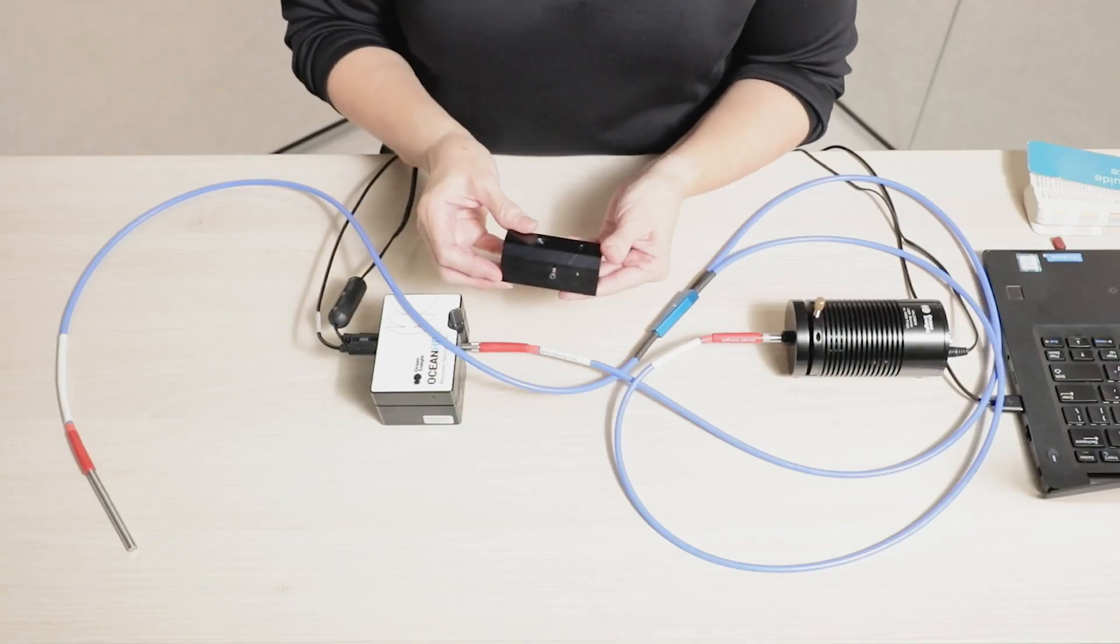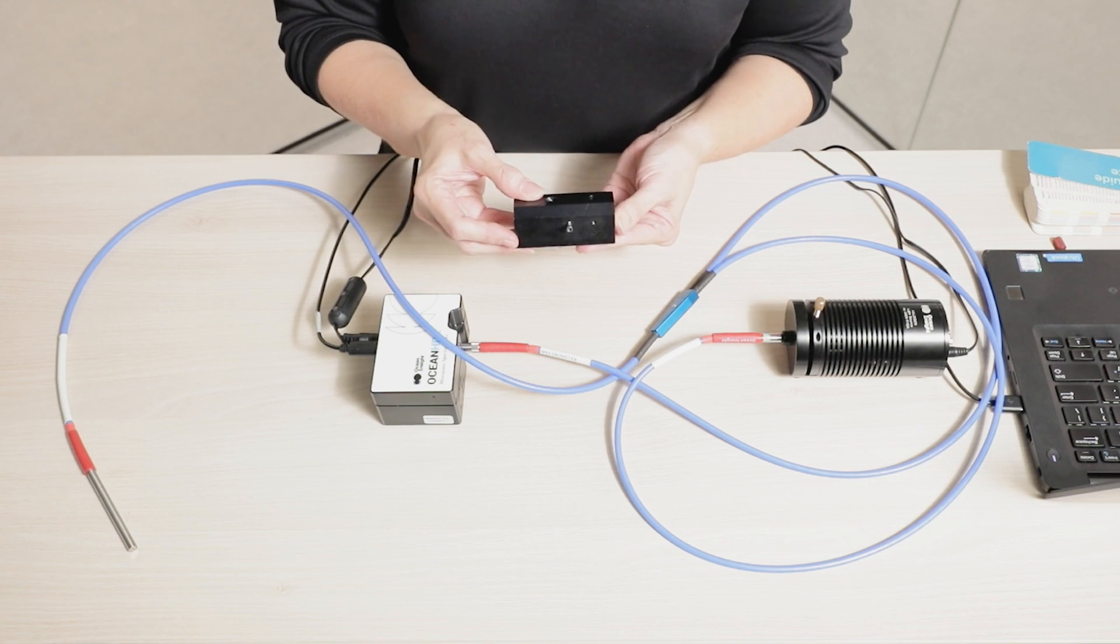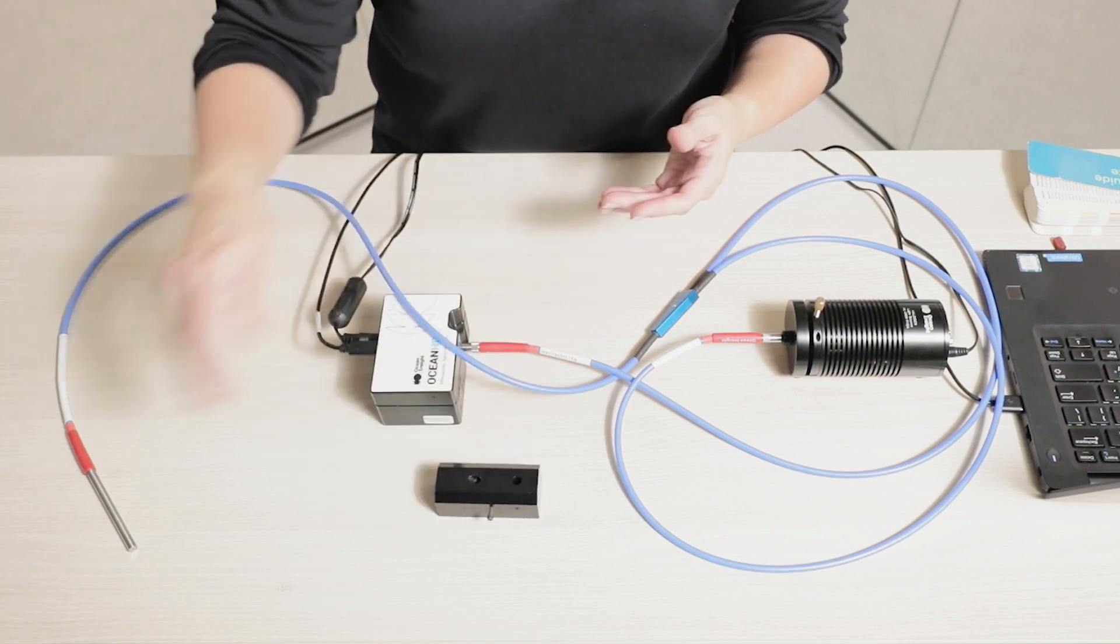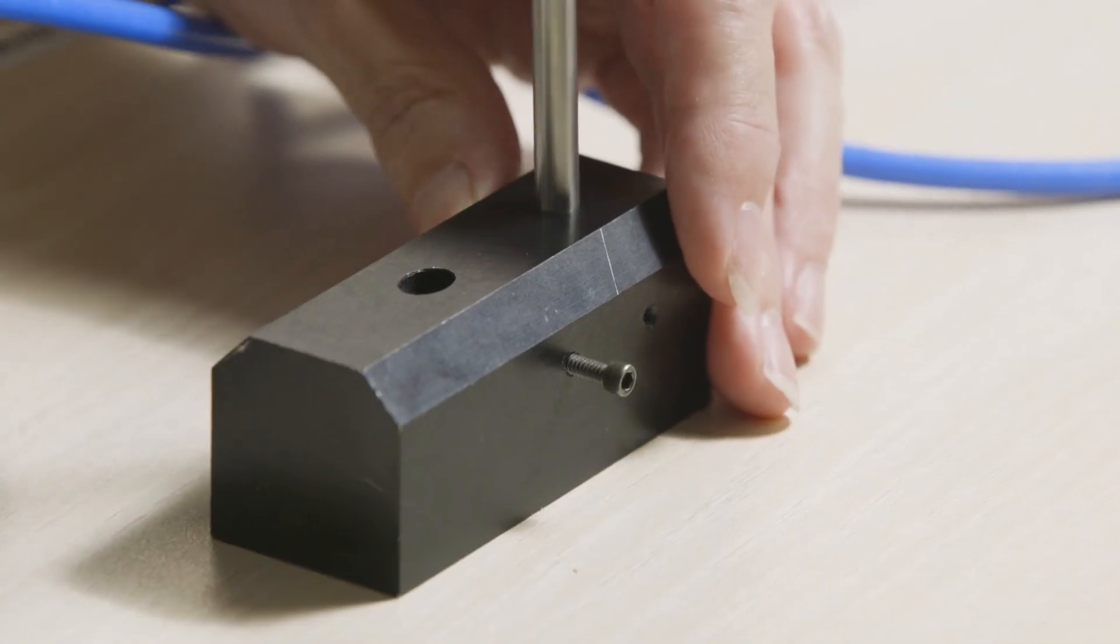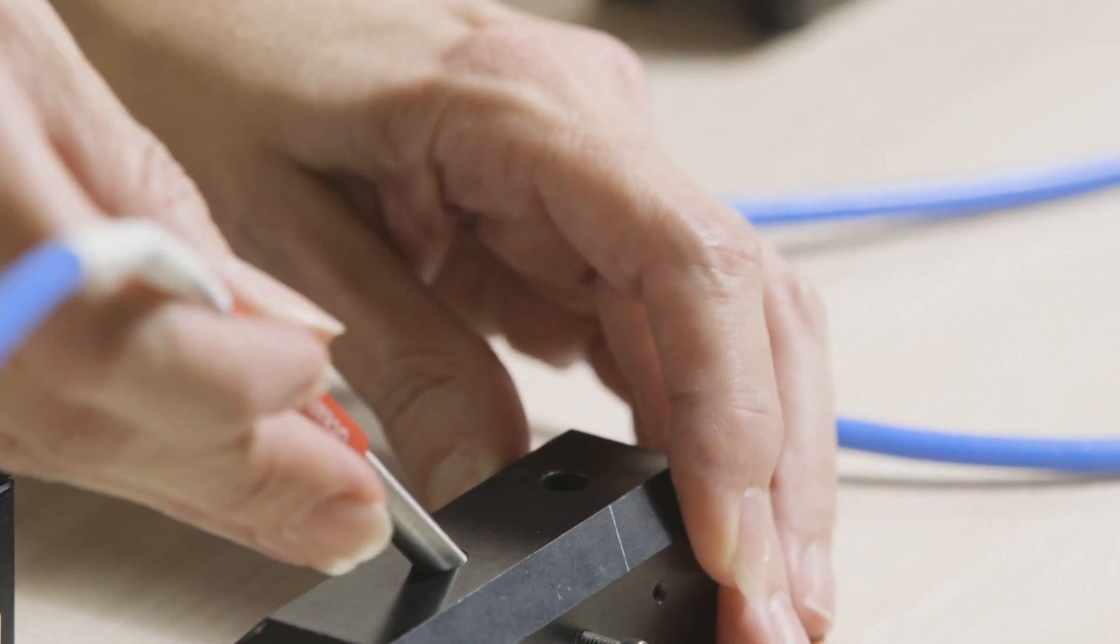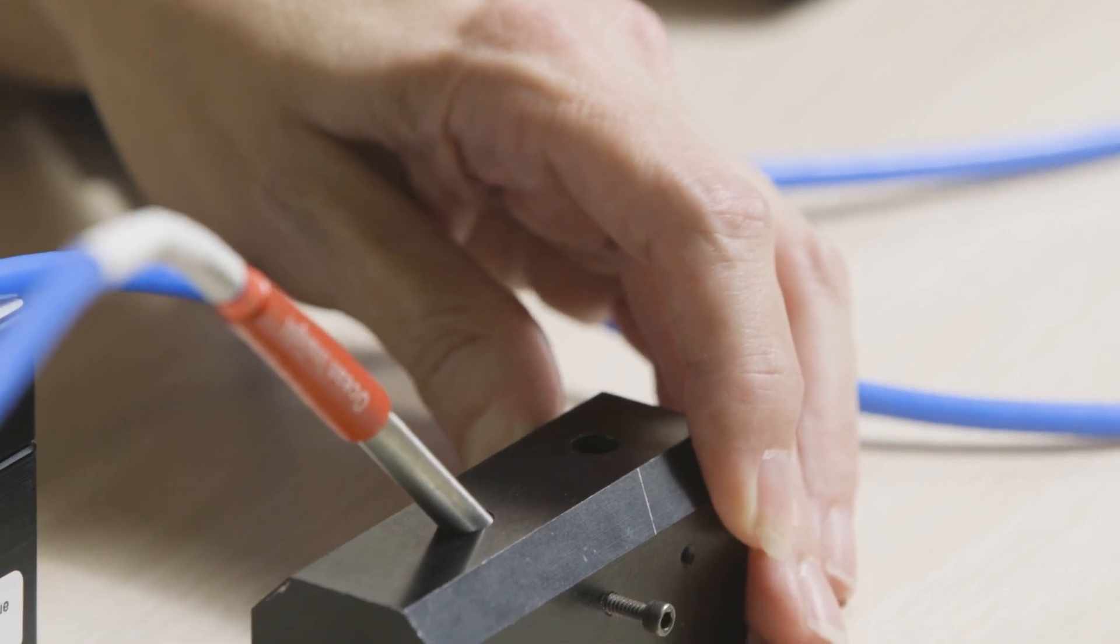We can then use a sampling accessory like our RPH-1 reflection probe holder to enable us to make either specular measurements, where we're looking at reflection at 90 degrees, or diffuse measurements, which we're looking at reflection at 45 degrees.